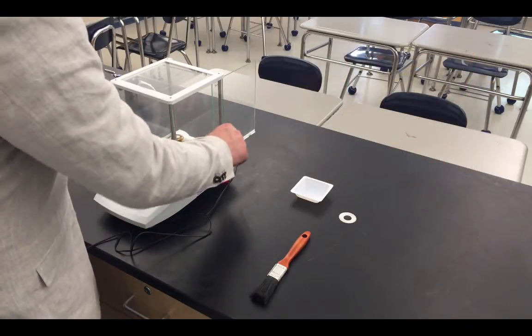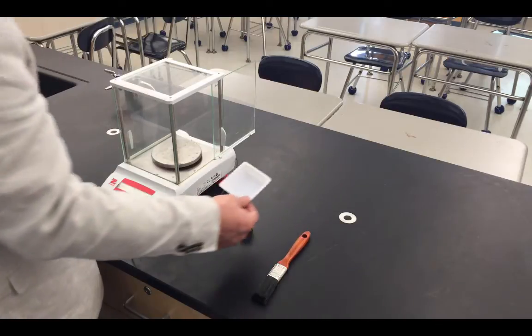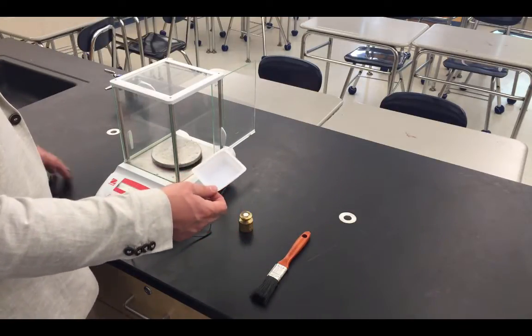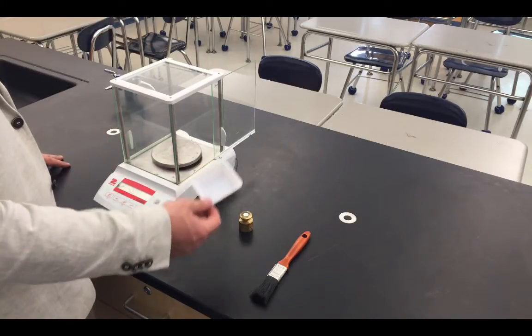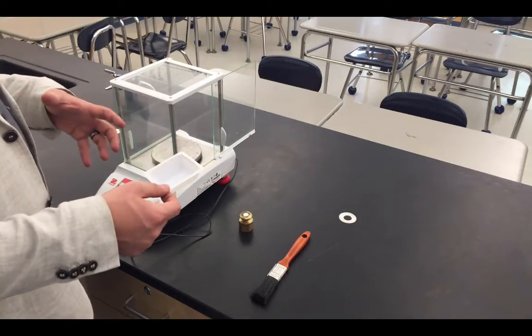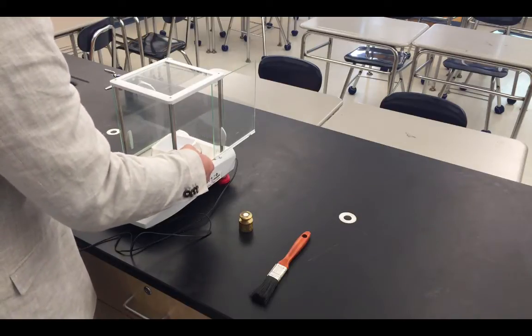If we want to record the mass of something that does not necessarily sit nicely on the balance itself, we can use something like this. This is known as a weighing dish. Now the downside of using a weighing dish is we want to know the mass of the contents of the dish, not the dish itself. In previous science classes, you might have weighed the dish separately, subtracted that mass out, and then got the mass of your items. This balance actually does a lot of that work for us.